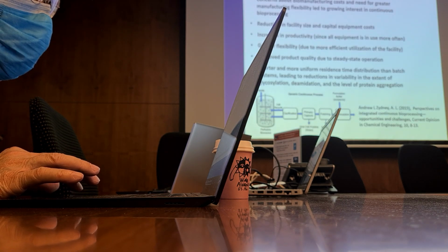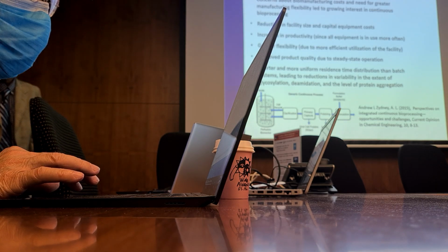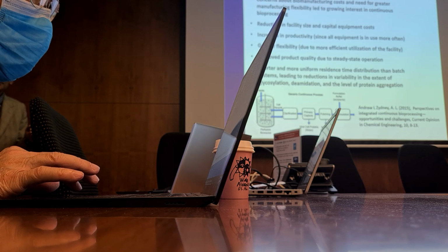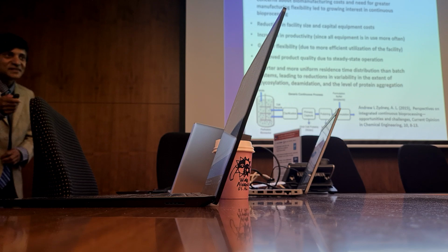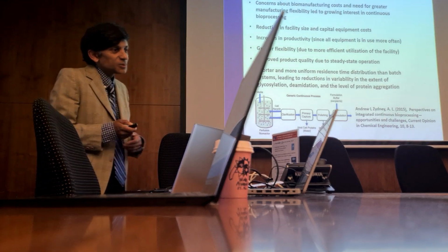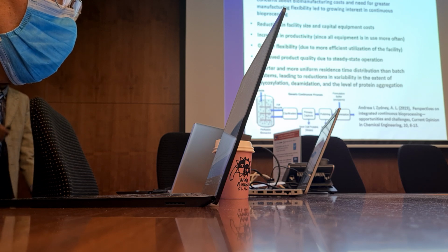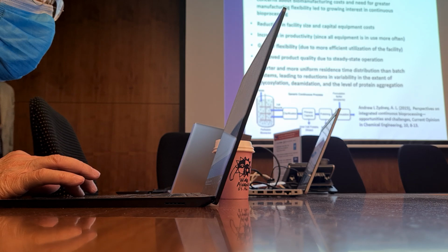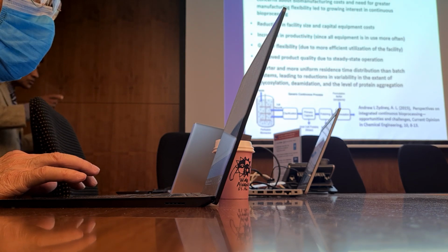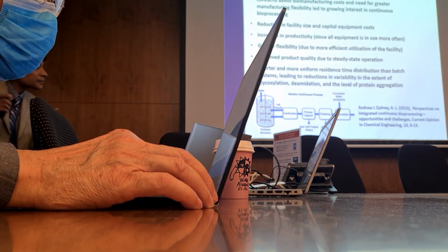But let me move on, because one of the emerging trends in biomanufacturing is something called continuous biomanufacturing. So, how many people here are chemical engineers versus civil engineers? Chemical engineers. Okay. So for chemical engineers, continuous, we typically think of a chemical plant, and you're running a cat cracker, I don't know, for a year or more, right? In the biotech industry, continuous biomanufacturing would mean maybe 1 month, maybe 2 months. But it's certainly not 8 hours or something like this, okay? Because at the moment, you grow your cells, that takes a while, and then each unit operation should not take more than 1 shift, at most.